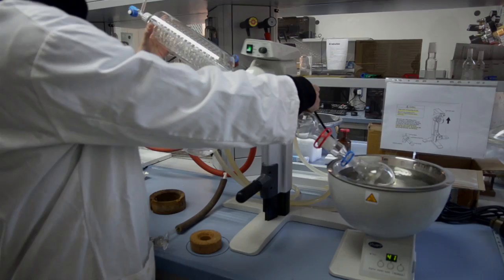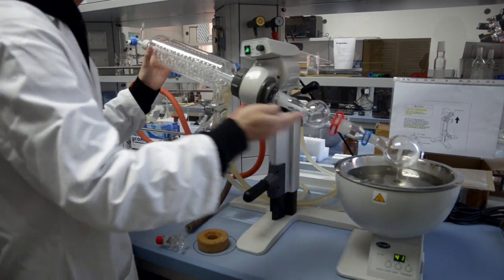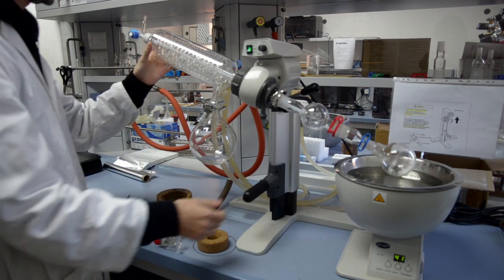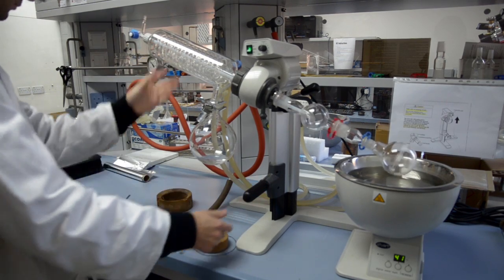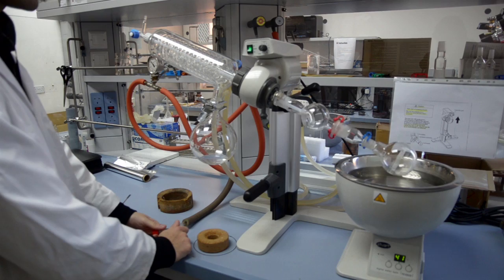Once done, adjust the angle to near horizontal if necessary to prevent backflow of the solvent. Slightly open the vacuum valve and close the vacuum line completely while still leaving the rotation on.